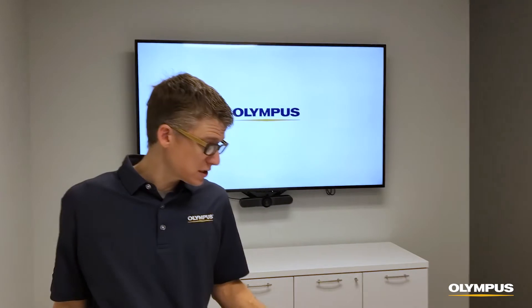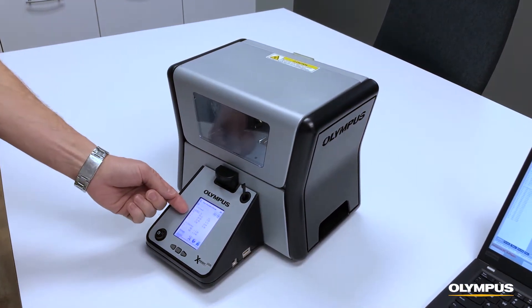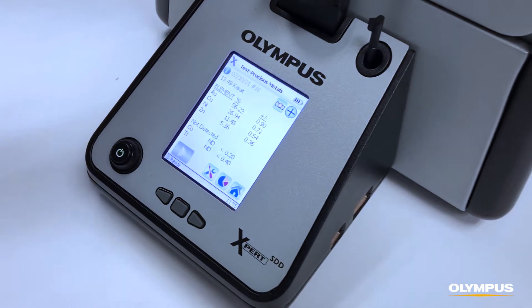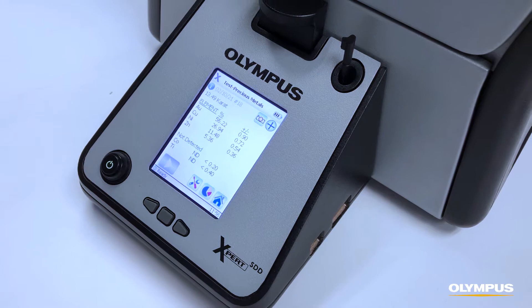The first is the Gold Expert. The Gold Expert provides elemental composition and carat information in a matter of seconds. The viewing window provides visibility on the sample at all times for transparency between you and the customer.